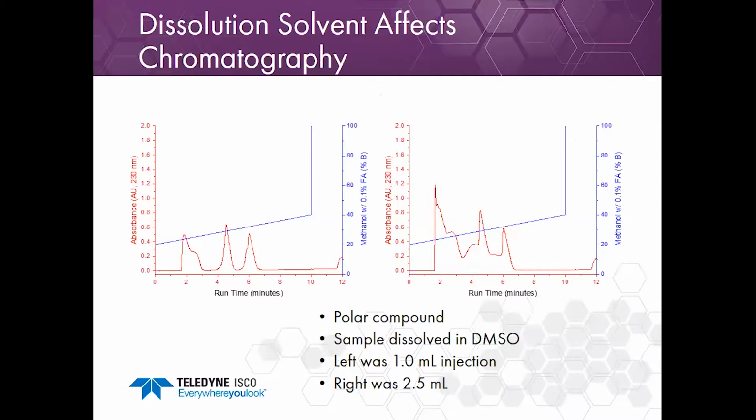Same thing in preparative chromatography. In this example, I have a couple of compounds that I dissolved in DMSO. What we see eluting at about 2 minutes is the DMSO. And then at about 4.5 minutes, you see the first peak and the second peak at 6 minutes. This is a pretty good purification, where the peaks are well resolved at baseline, and that would be an acceptable purification.